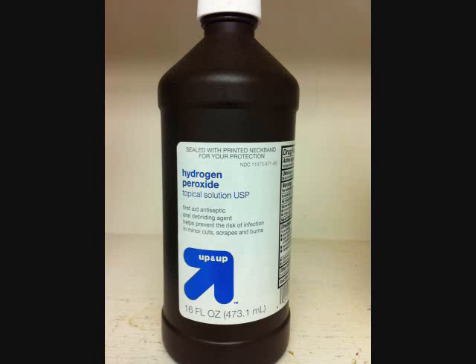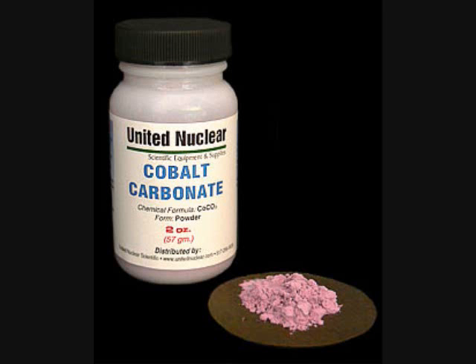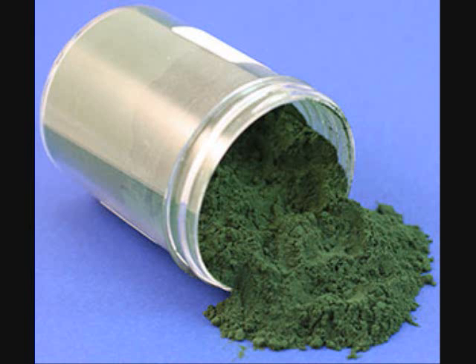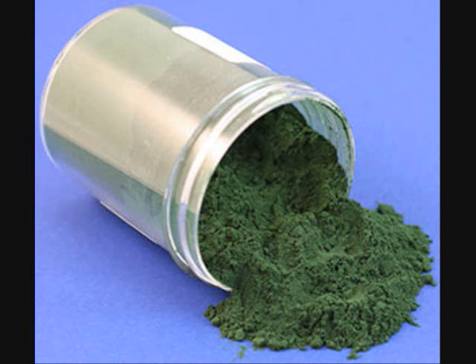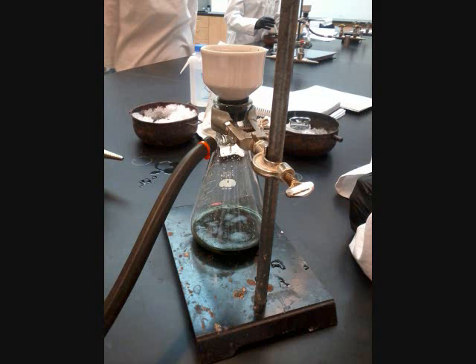We knew a reaction took place because the solution changed from the pink color of cobalt-2 carbonate to a much darker green, the color of cobalt-3 ACAC. Thus, we were left with the desired products. However, it had not yet been purified, so instead of looking like a nice dark green color, it looks like some weird spinach drink you might find at a health food store, and I suspect the two are about equally as drinkable.